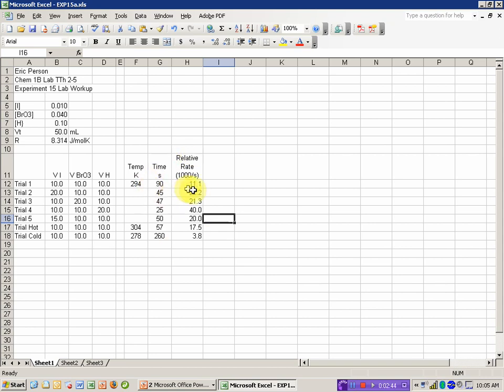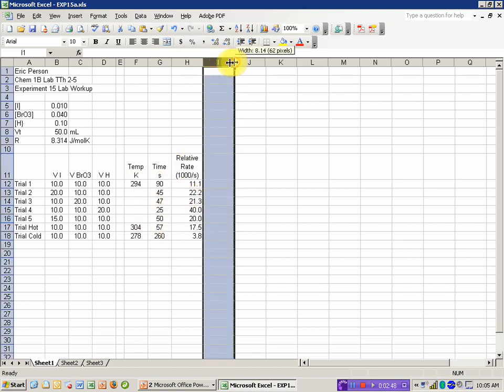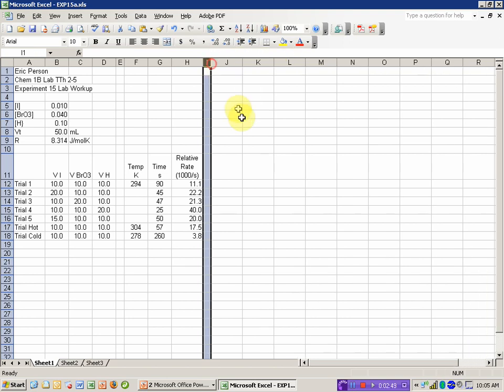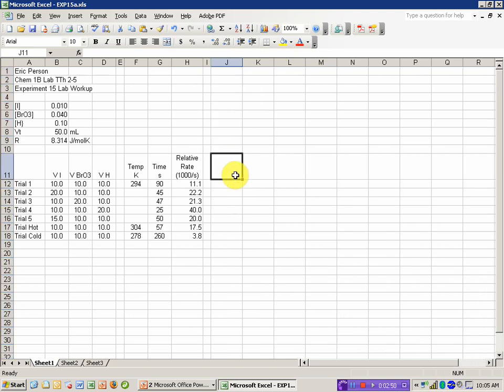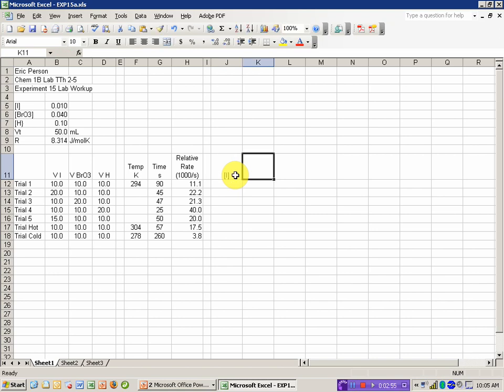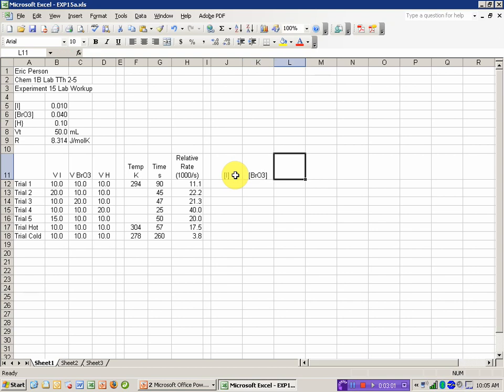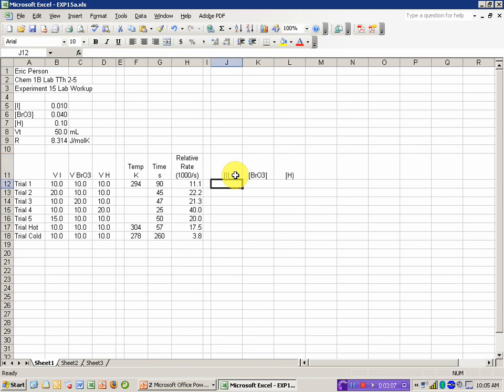So that gets me set up. I have a relative rate. I have my time and temperature. I want to calculate my concentrations now. So this is going to be my concentration of iodine. This cell will be my concentration of bromate. Or sorry, not cell, column. This column will be my concentration of the hydrogen ion.